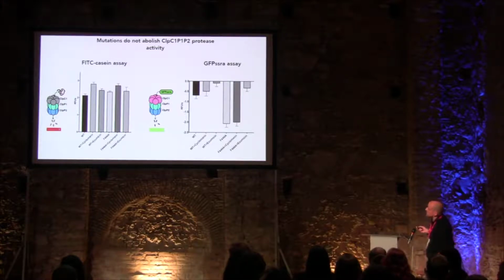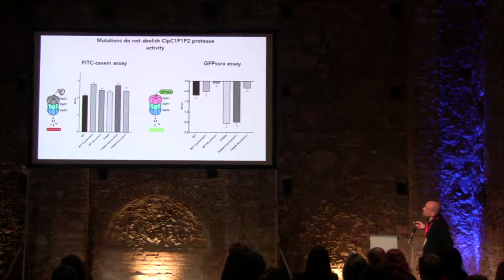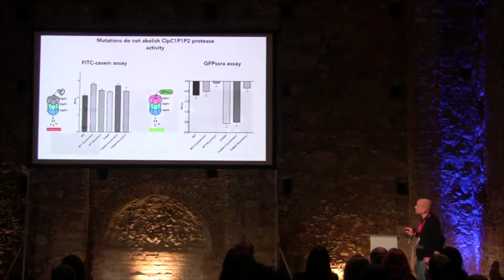Another type of assay uses GFP, that you all know, I guess. GFP is an intrinsically fluorescent protein, very, very stable in contrast to casein. And basically the idea here is that as GFP is recognized by ClpC1, it is unfolded and translocated inside of ClpP, is separated into pieces, and of course you have a net decrease in fluorescence. And you still see the response to the antibiotics. That's our goal, to understand how the antibiotics work, so that was extremely good.